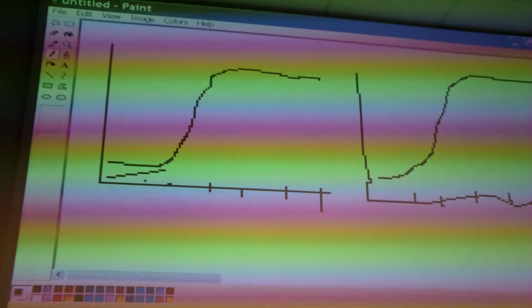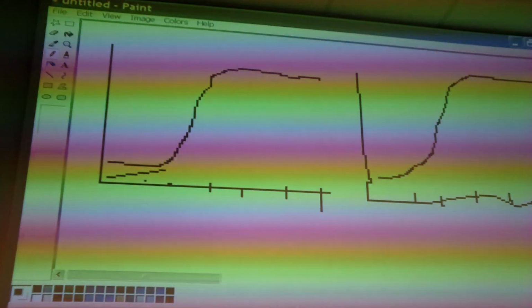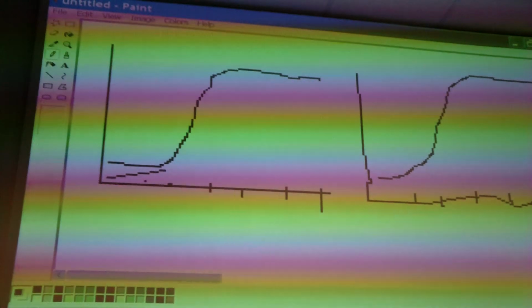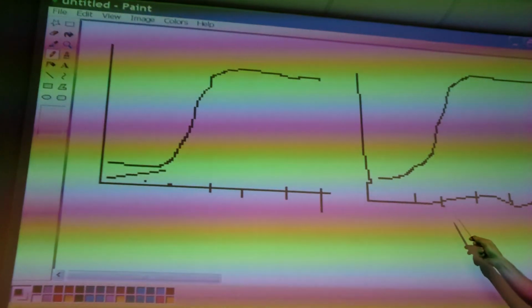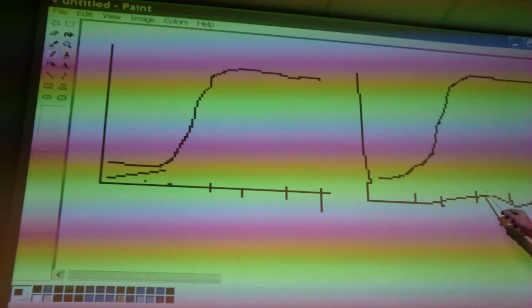Okay, let's say this is undiluted. This is 1-to-1. This represents a 1. This is undiluted. That's the reason why we can't use undiluted sample, because it gives too high a signal. Let's say this is 1-to-100 dilution. That's why we can't use 1-to-100, because that's too diluted. We need to use 1-in-10 or something.